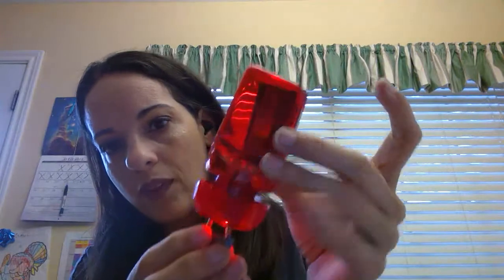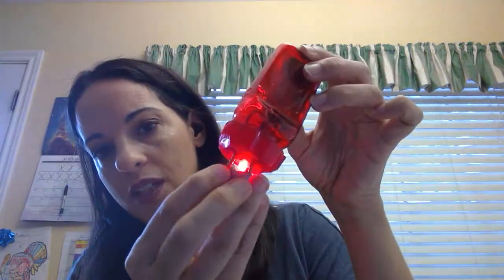All right, here's element number 4. You can see that this is very reflective. You can see it catching the light. And then I can see again from my Petri dish, if I took a hammer to this, it breaks into these pieces. It does not flatten, it breaks into pieces. And if I use my conductivity tester, I can see that it lights up. Okay, fill out your chart for element number 4.